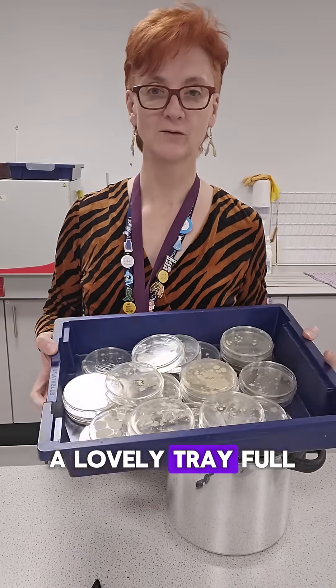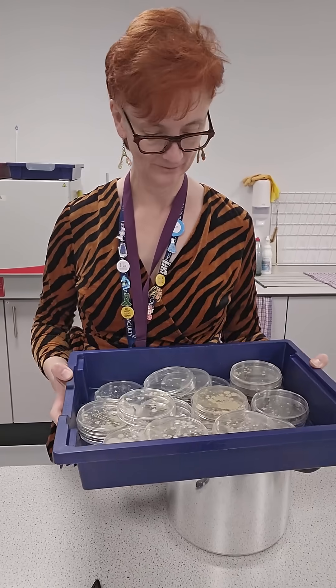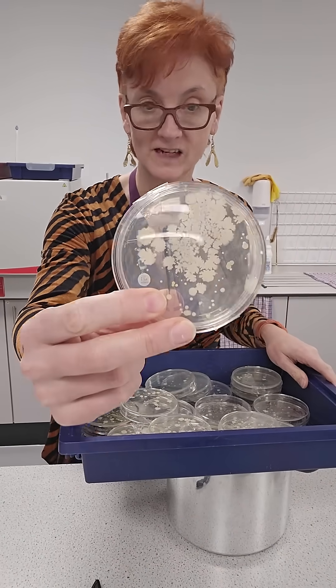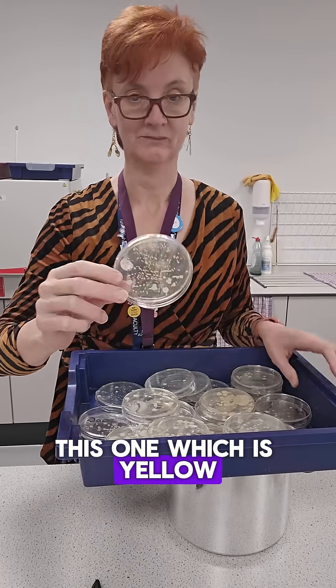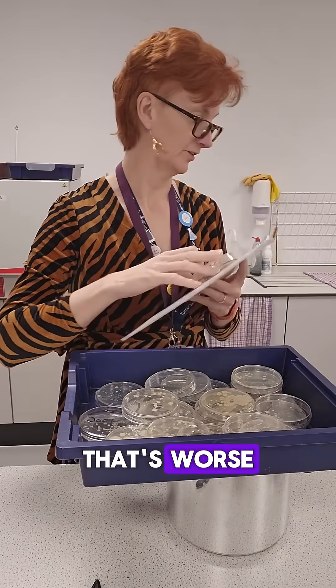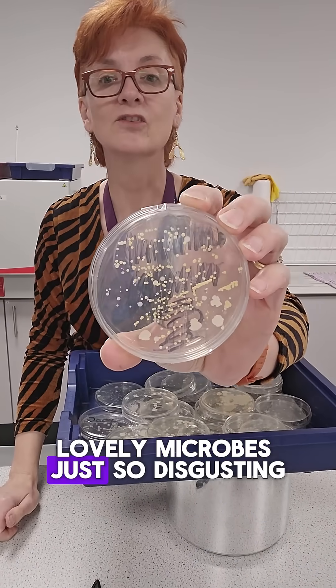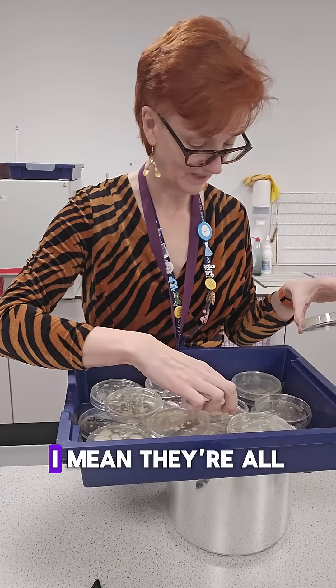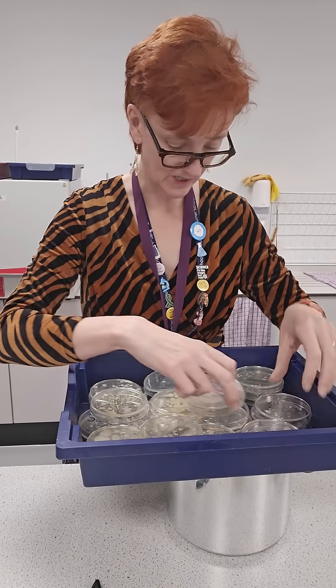So here we have a lovely tray full of microbes. Let me show you some of them — look at this one. Looks a bit like lovely Christmas snowflakes. This one, which is yellow. Maybe I'll put something behind them. That's worse. Lovely microbes. Just so disgusting. This one, just like fluffy clouds. They're all pretty revolting.